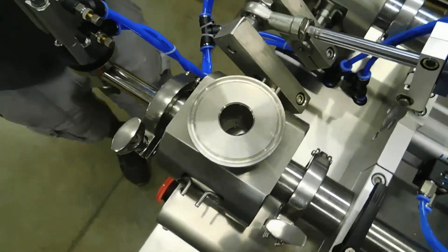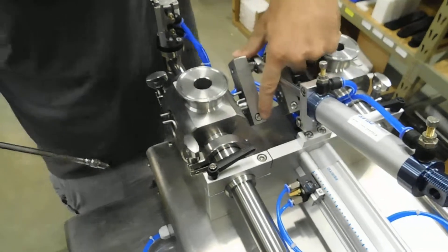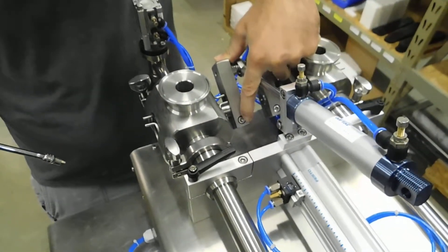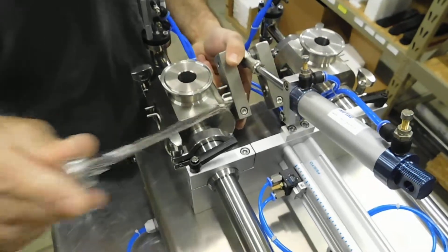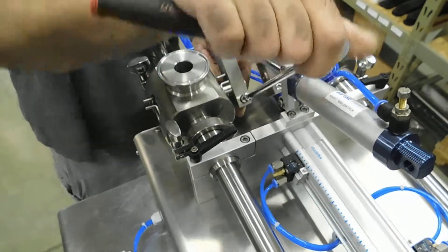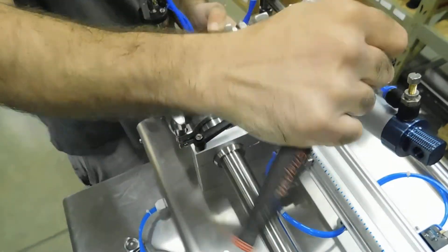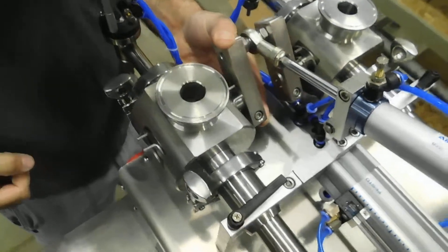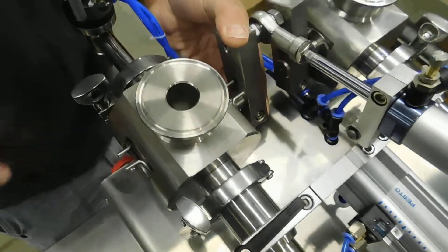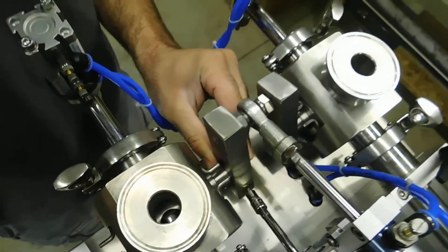So what we'll do is use a 5 mm Allen wrench. The bolt on the actuating arm is right here — you need to loosen that up until it no longer has tension on the core. Then rotate the arm a little bit and tighten your bolt back down.